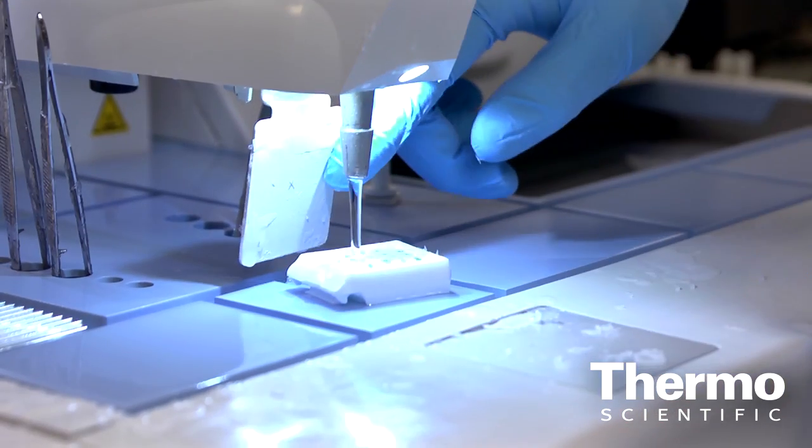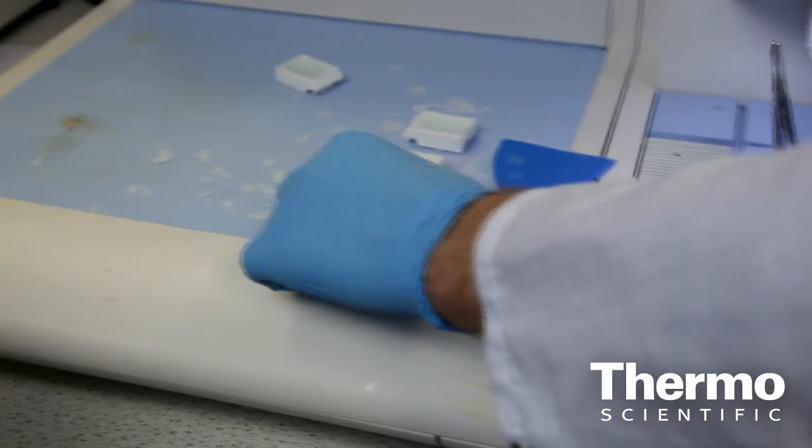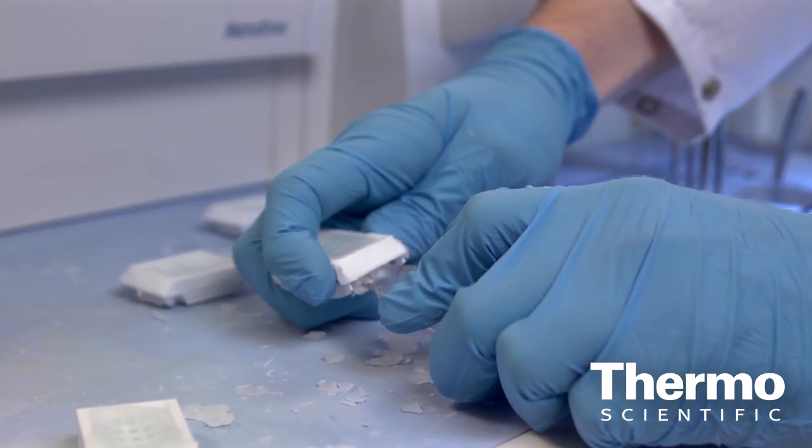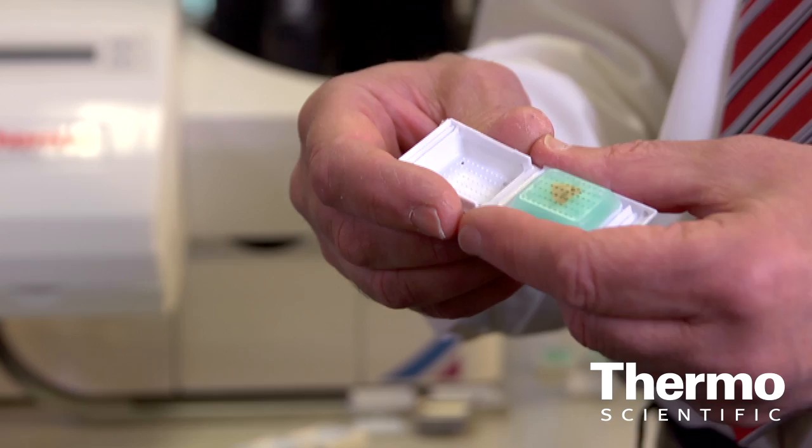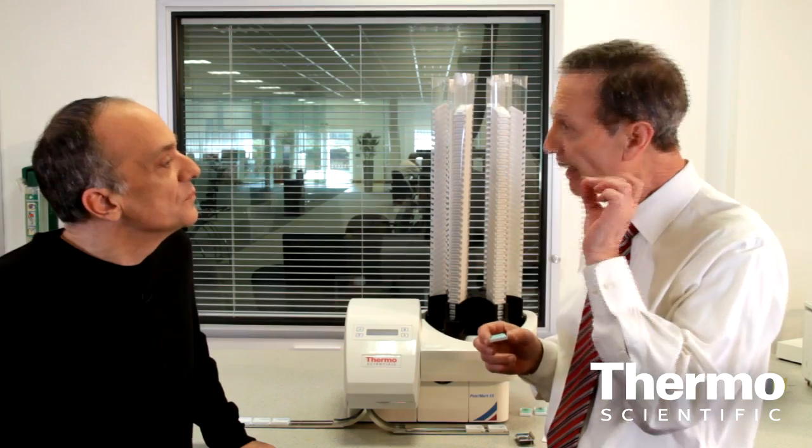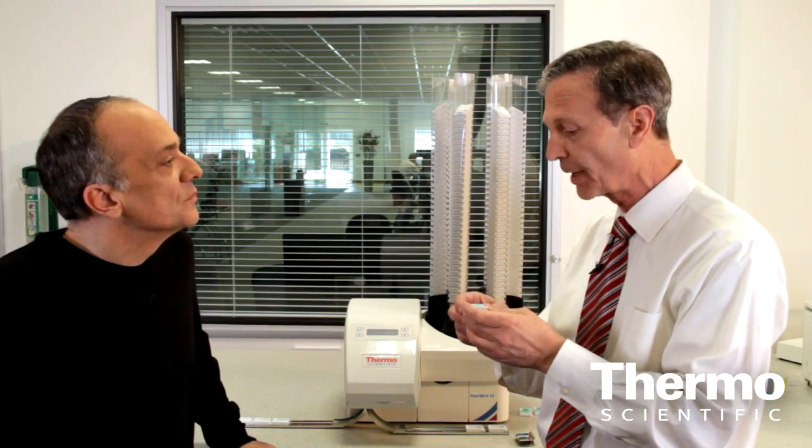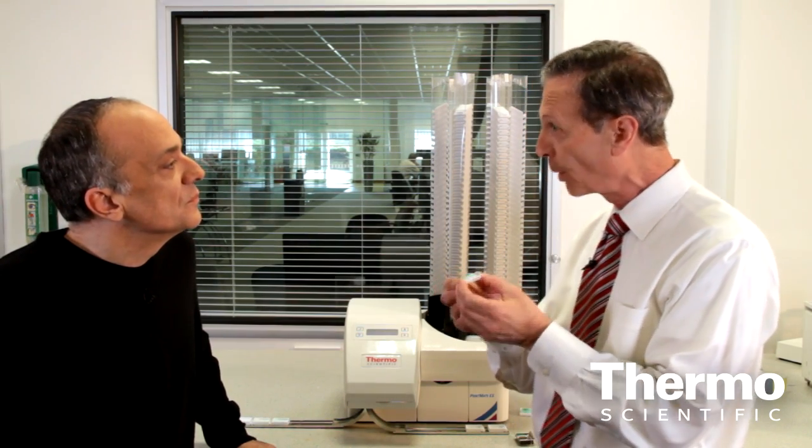Then all the histotechnologist needs to do at embedding is simply fill this cavity with wax, place it on a cold plate to cool and then snap it open and here's one which has been filled. There is your block, get rid of the base mould, you're ready for sectioning. We take 50% of the time out which is huge to any histology laboratory. In addition to that, we've improved quality.